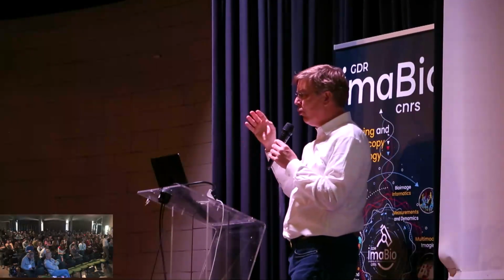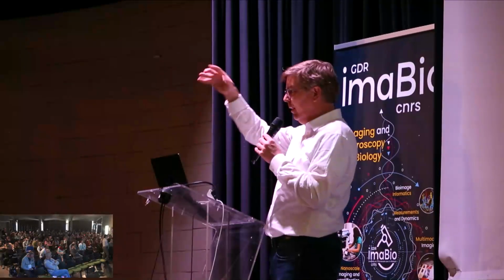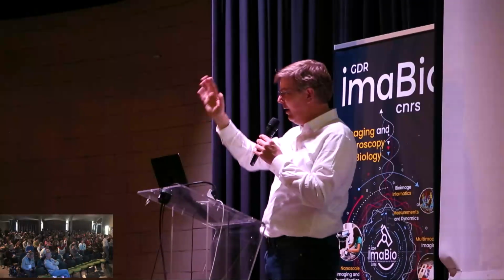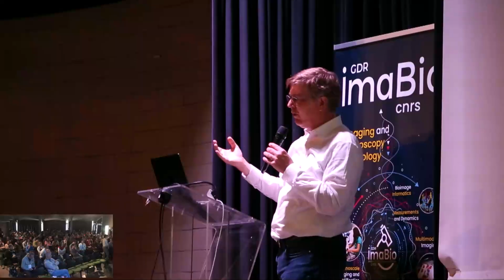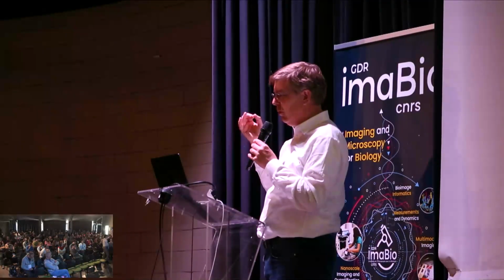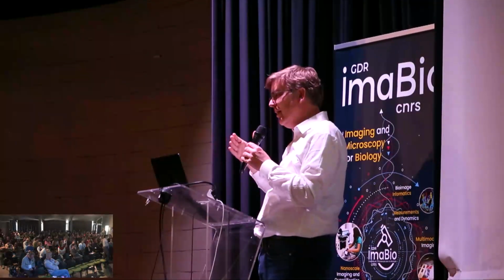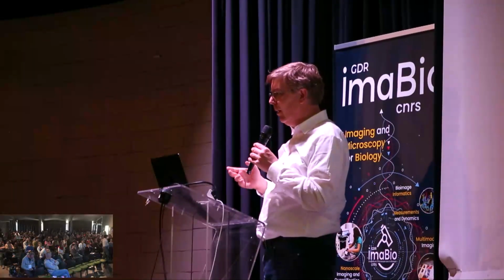For many probes, fortunately, it doesn't matter too much because there's a certain level of flexibility, and over a second or so, where you localize the molecule, it will have somewhat averaged out. It will not be perfect, but it works reasonably well. But you always need to keep that in the back of your mind before you draw conclusions where you say, well, these are 12 nanometers apart. It might be a little bit more, a little bit less. So you need to be careful there.